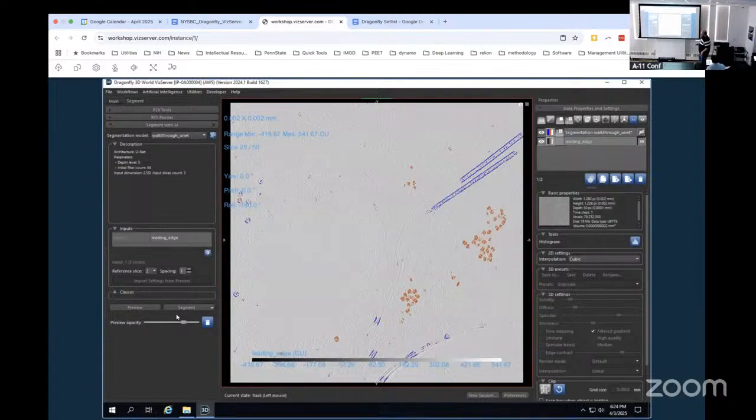So, yes, I have a tutorial that goes through generating simulated data with CTS, how to open it in Dragonfly and train networks. This one with all of the hand segmentation stuff, I'm still finishing it, but it is close. I'll get it to you after this workshop so that when you go home, you have a step-by-step walkthrough that you can hand to anyone else in your lab and teach them how to do this. But so what did we get, right?